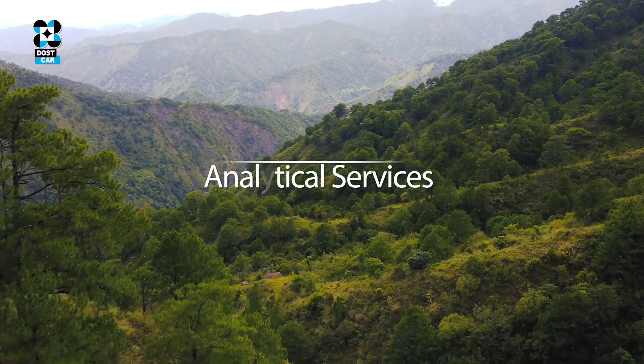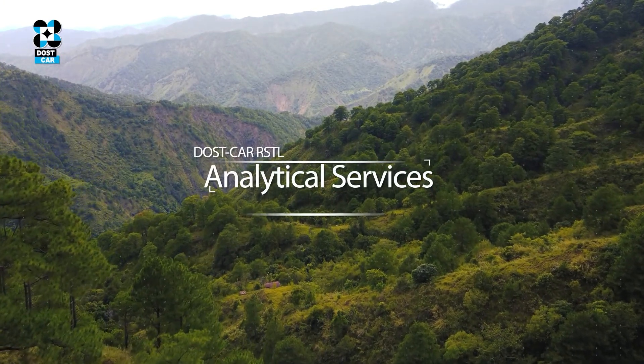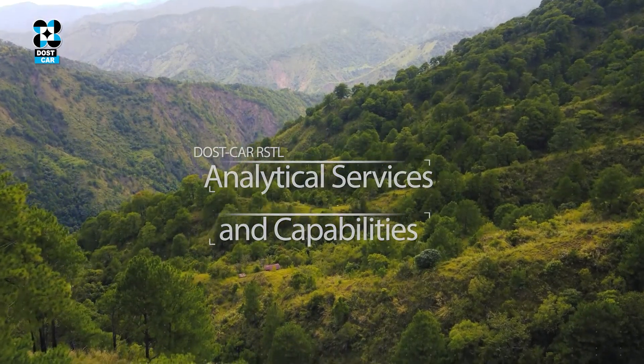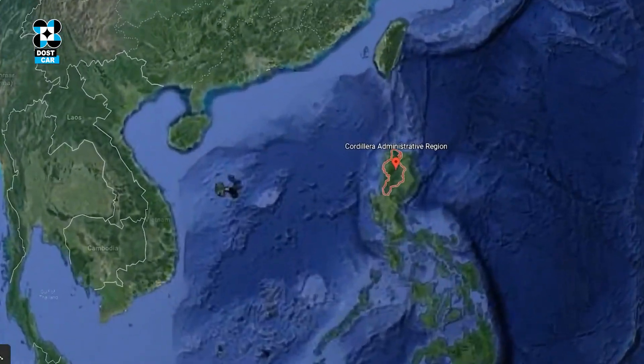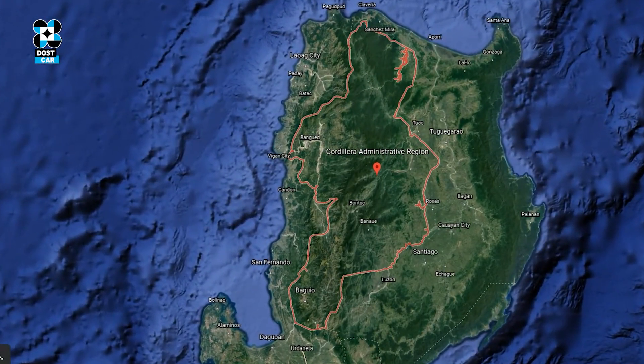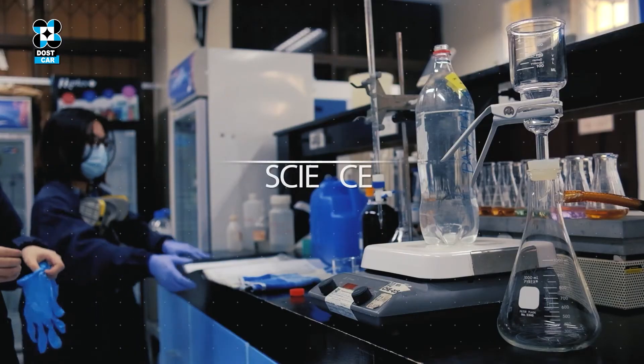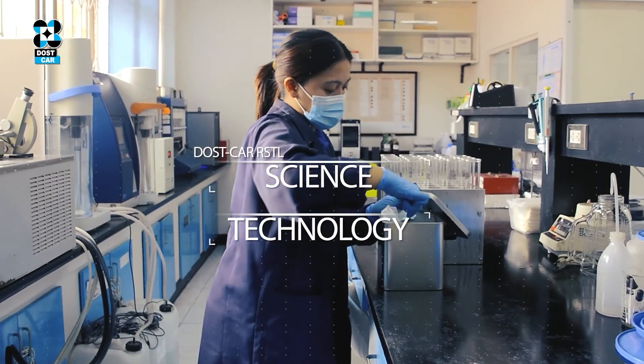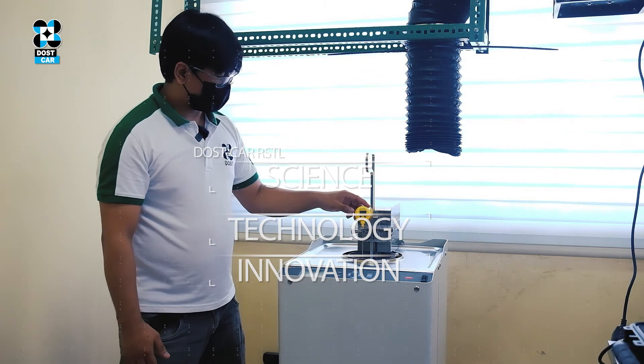With this wide range of analytical services and capabilities that the RSTL offers, DOST CAR ensures that various stakeholders in the region are thoroughly supported through science, technology, and innovation for the benefit of the people.